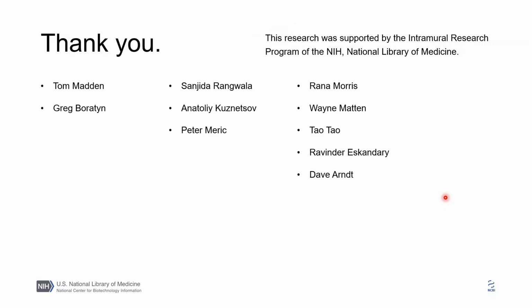Thank you. Thanks, Valerie. There's a couple of questions about content that I did not know how to answer that Valerie might be able to help with. And someone asked about filtering Magic-BLAST alignments, and they mentioned MAPQ flags or anything else, thinking about multi-mapping or discordant reads.